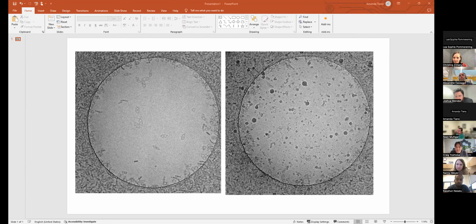So, yeah. One thing you can do is a long cryo cycle, just to make sure if anything is there, you can remove it. Okay. And ask the engineer to check the cryo box. Okay.